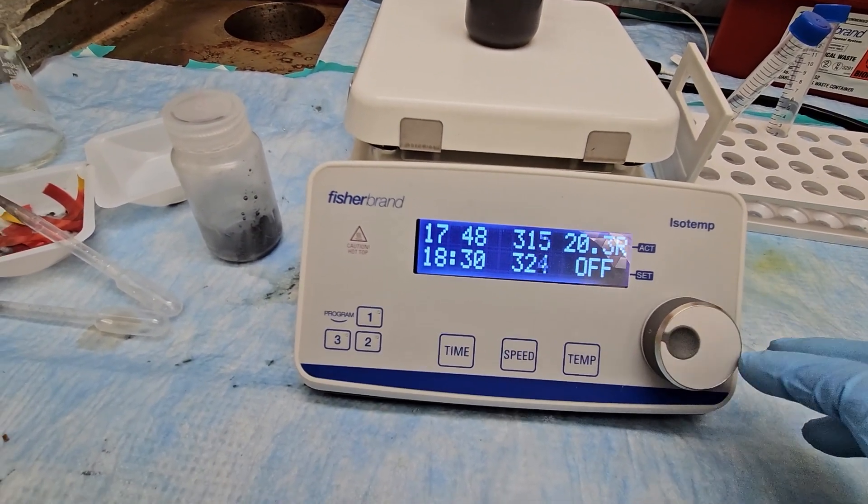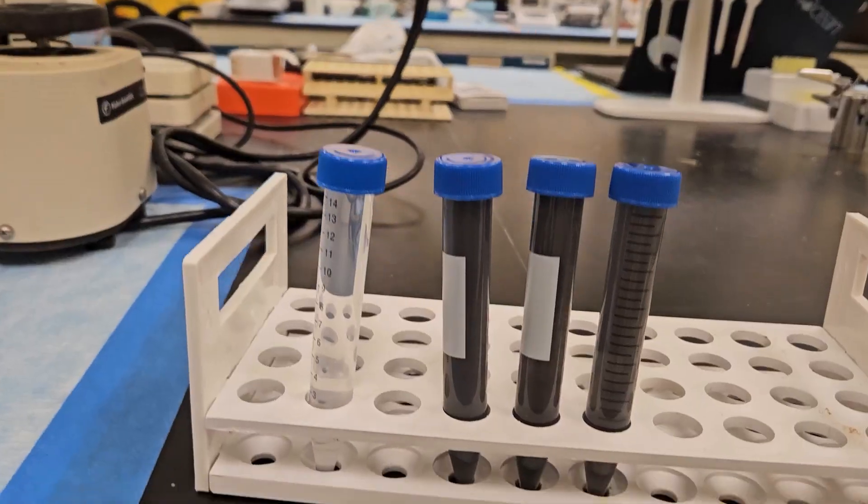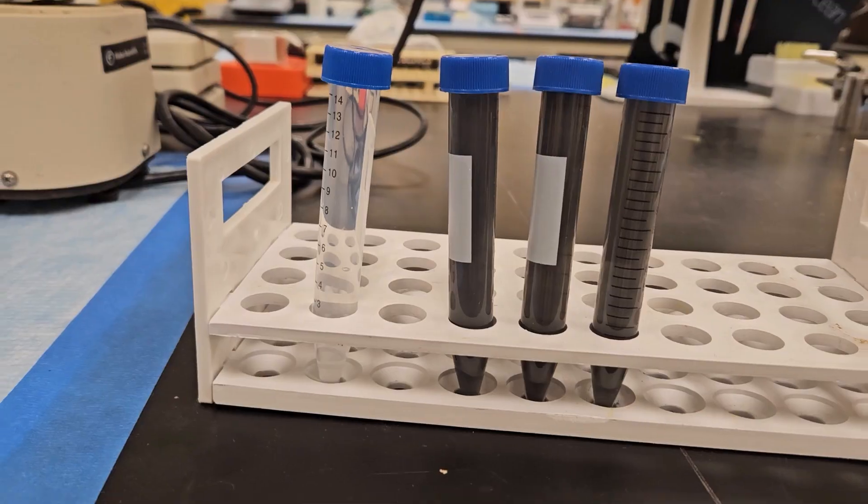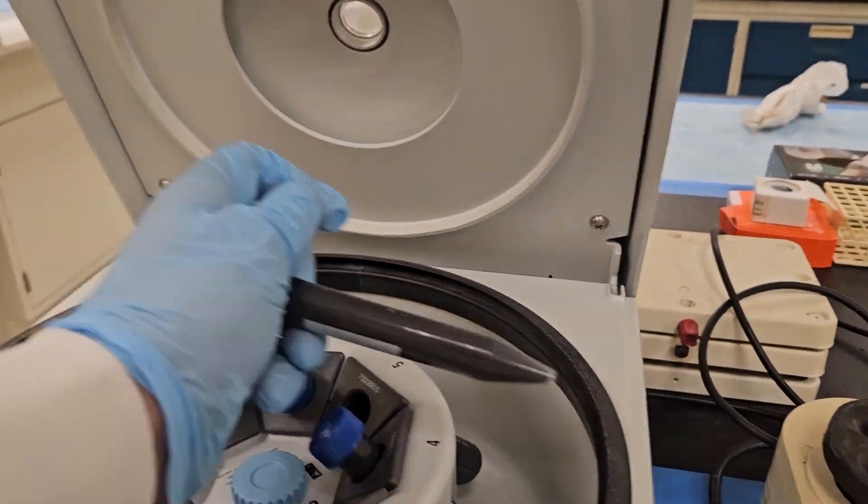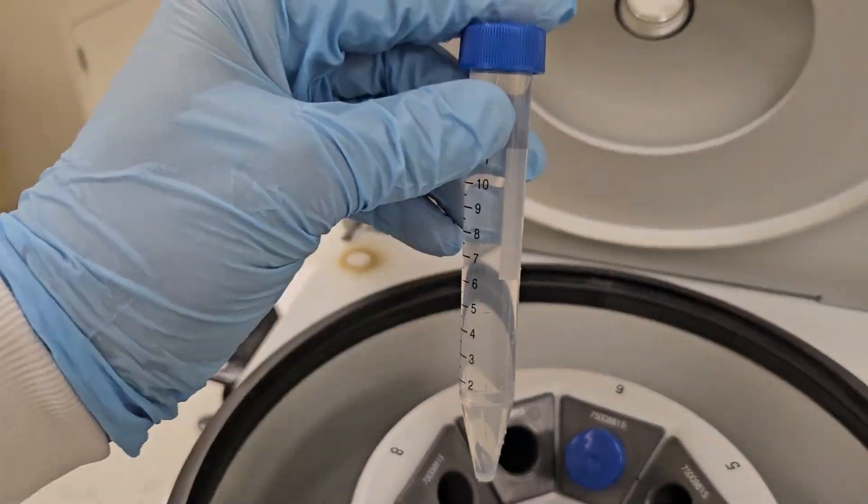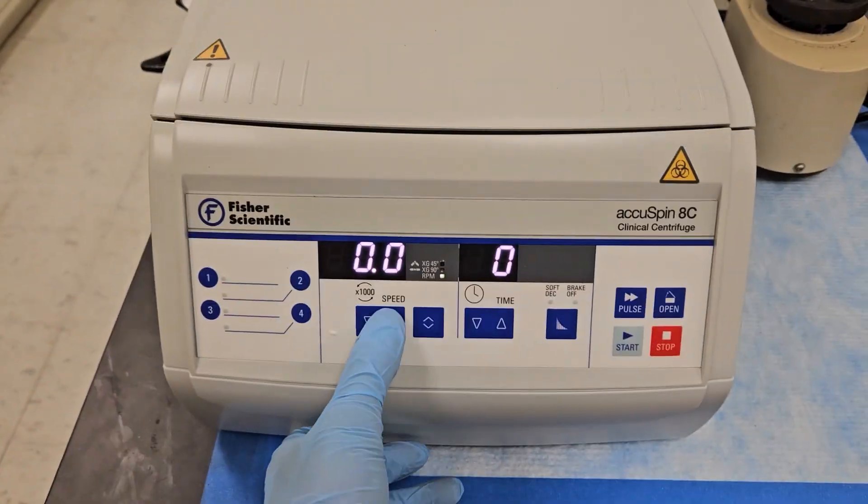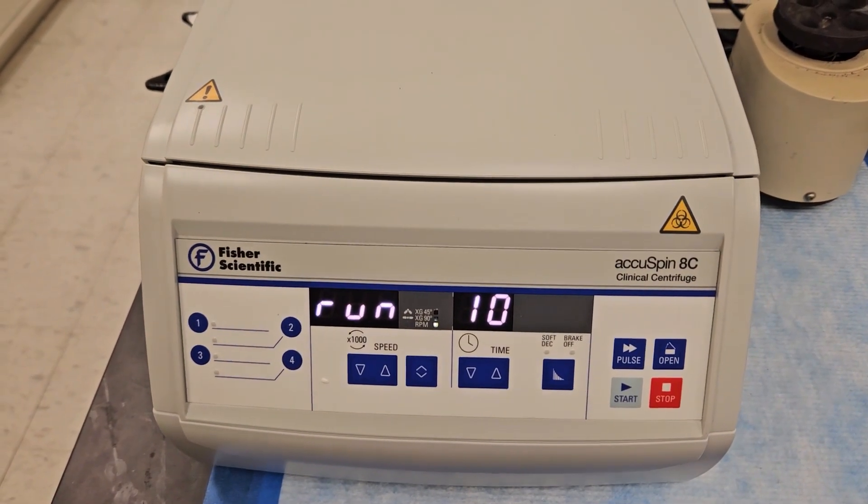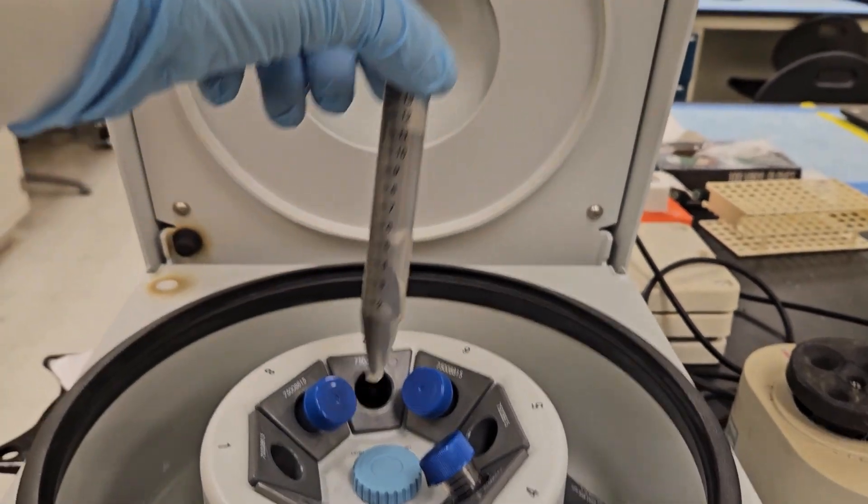We will then repeat a step similar to washing, where we transfer the solution into centrifuge tubes, and spin at 250 g for approximately 15 minutes, and repeat the process of decanting the clear supernatant. We will do this approximately three to four times, until we receive a supernatant that has a cloudy dispersion in it, as you can see here.